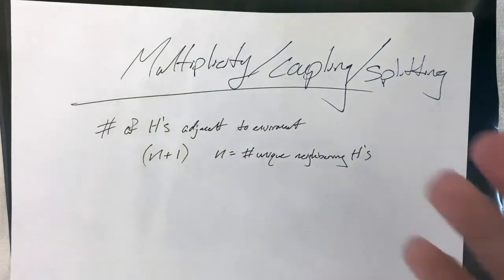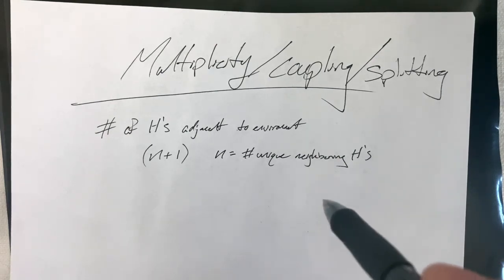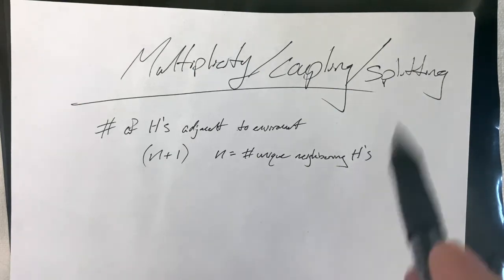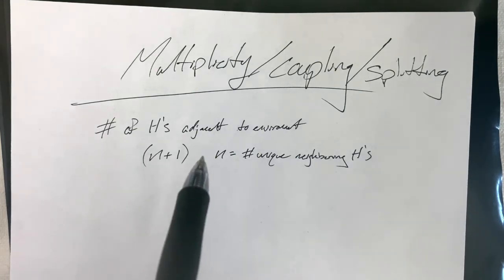So when you're given a molecule and you're asked what is the multiplicity, for example, of a given atom, so if you're looking at a carbon, what's the multiplicity of that group? You're looking at this rule here.